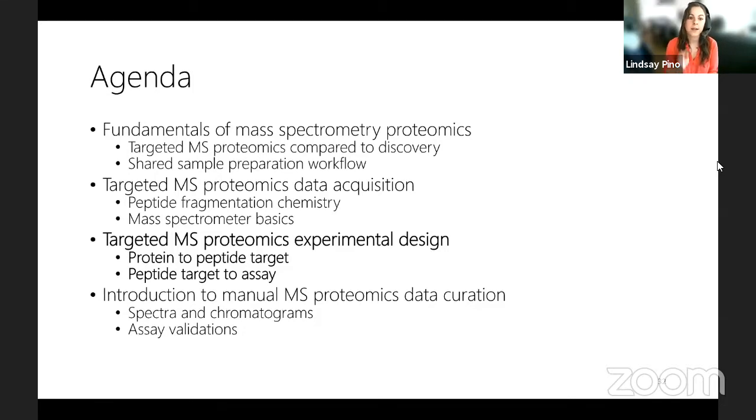So that's getting a little ahead of myself. I'm going to come back to that question later. Having different resolutions for mass spectrometry scans does not cause important problems for Skyline.